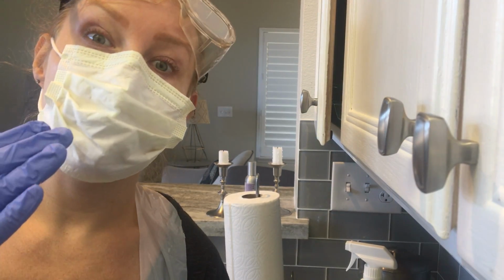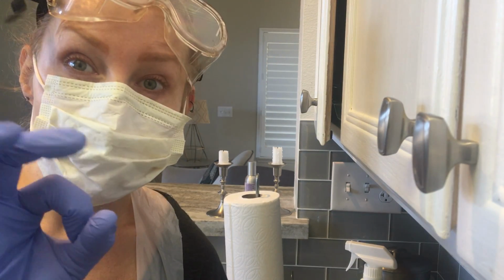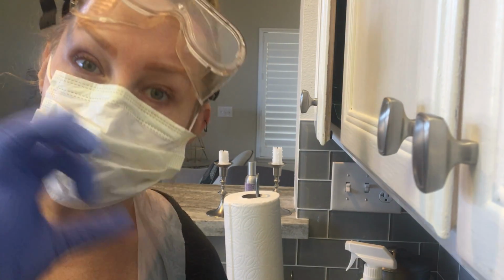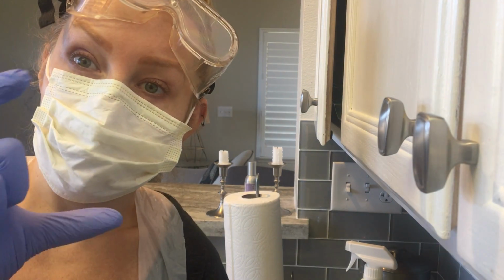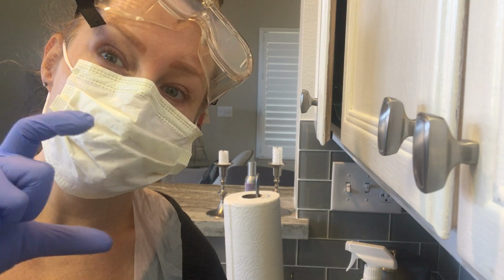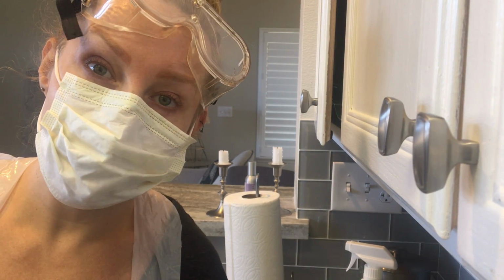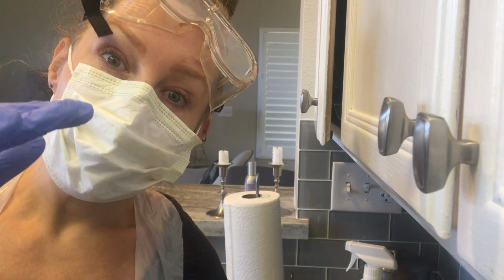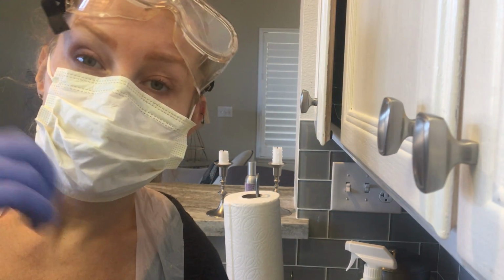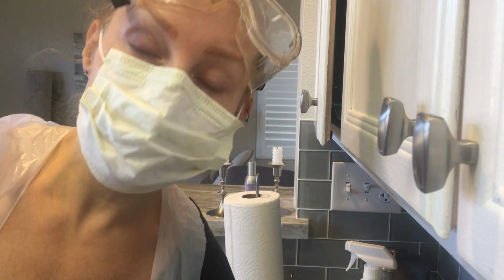So the first video, remember, I used the tablets, mixed the yeast. We had the E. coli tablet, the yeast. We put them in our little test tubes and shook them up, and they had a period of incubation for about 48 hours. Then from there, I took an inoculation loop and spread the bacteria over agar plates.